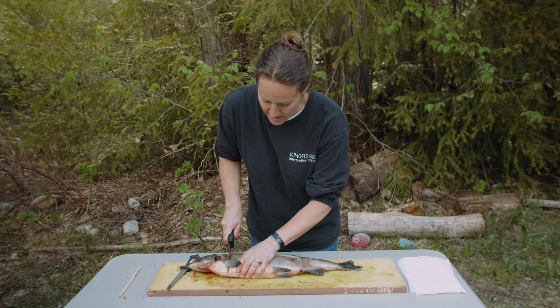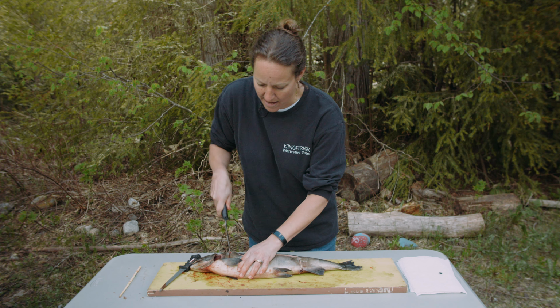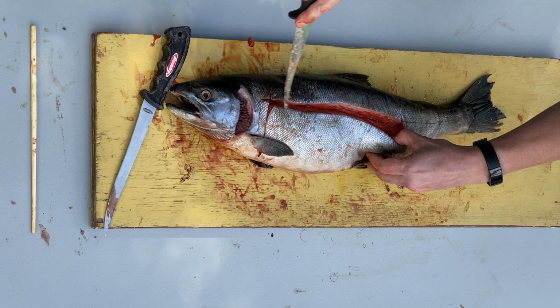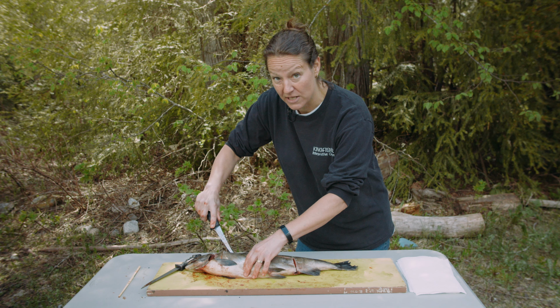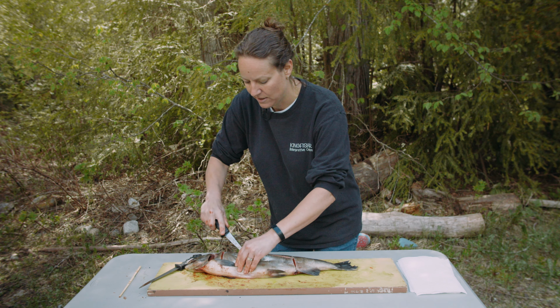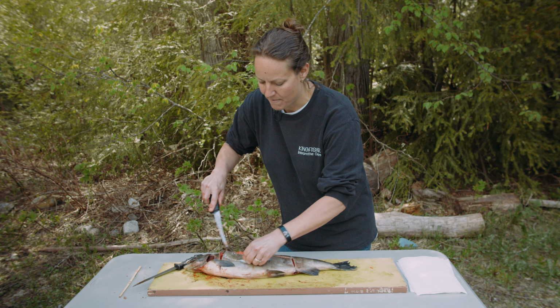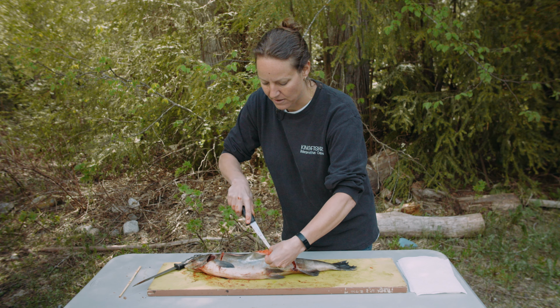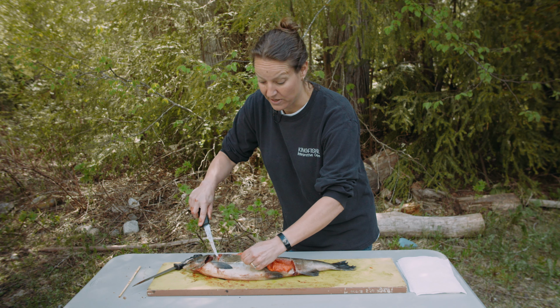Okay, now do another slice up here so we can open the window right behind that pectoral fin. And now I'm going to slice down the rib cage. Now the ribs, boys and girls, help give the fish its shape, and they're also used to protect the organs inside the fish. And the part that I'm cutting away is actually the muscle. Now, if any of you at home enjoy eating salmon, that's the part that we like to eat, is the muscle. Maybe not on this fish, though.